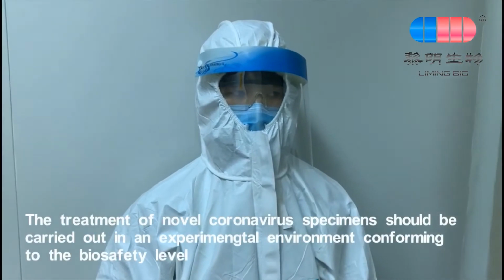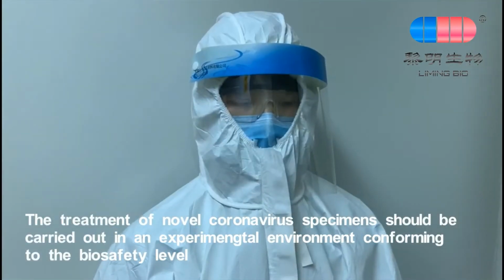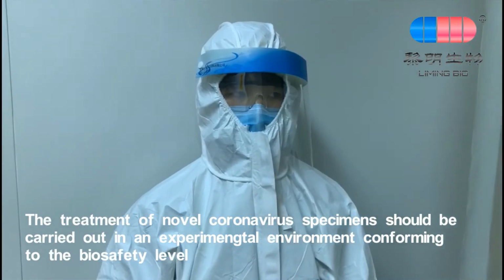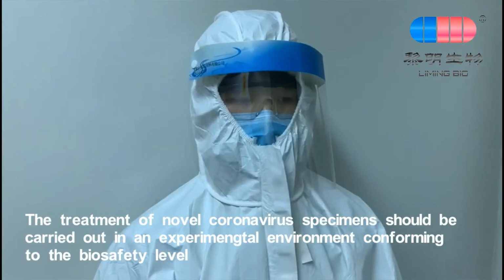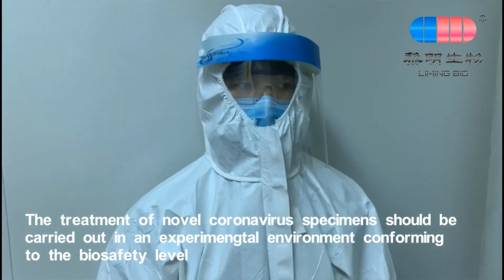The treatment of novel coronavirus specimens should be carried out by personnel trained in the relevant technical and safety procedures in an experimental environment conforming to the biosafety level.